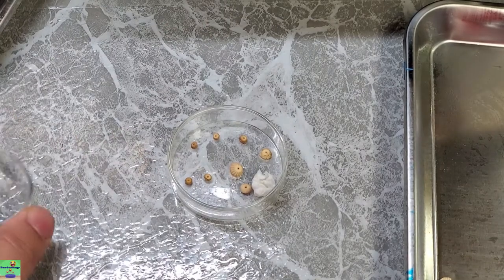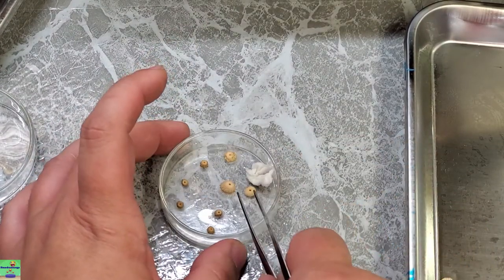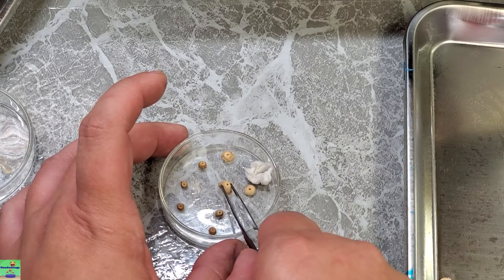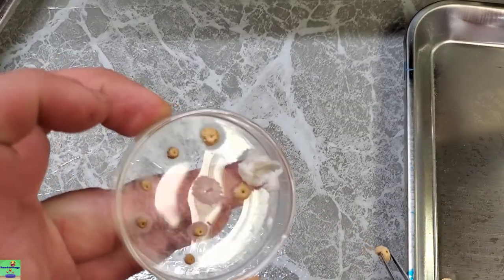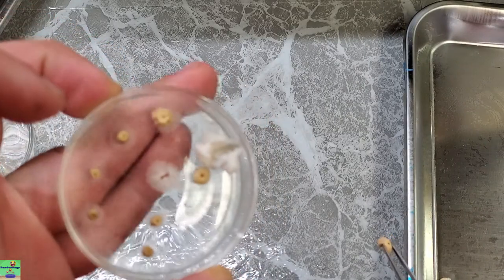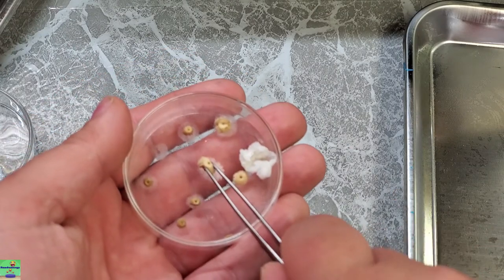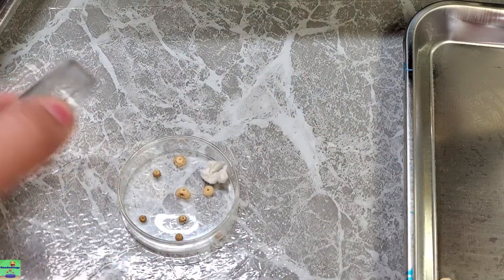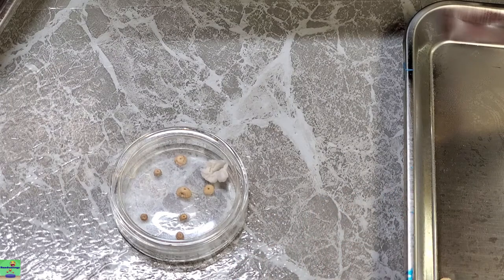Here I have the camera zoomed in a little bit so that you can see. Here is a decent size cap, and underneath is a really nice little spore print. It'll focus. As you can see, it's put off a relatively heavy deposit of spores. So I'm going to put that back on for now. I'm going to put the cover back on here because I want to transfer some of these spores onto agar.